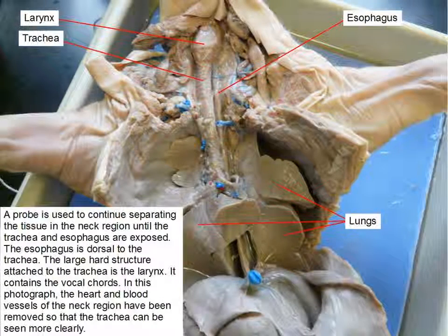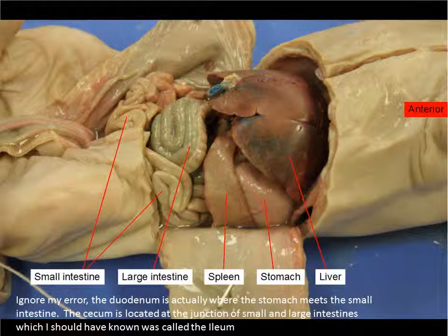But okay, so when we get to the actual cavity, please don't get the questions wrong on the test about the big, obvious structures. The liver's right there, taking up most of the room. You're going to have to manipulate it. Lift it up, move it to the side, and so forth.